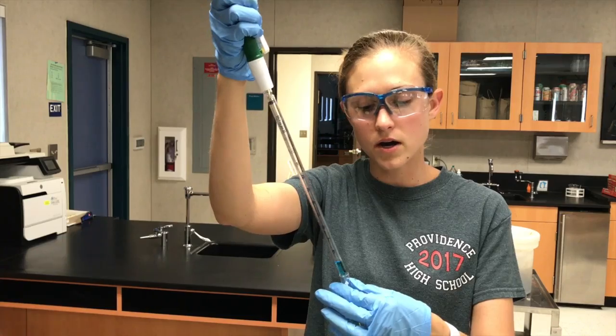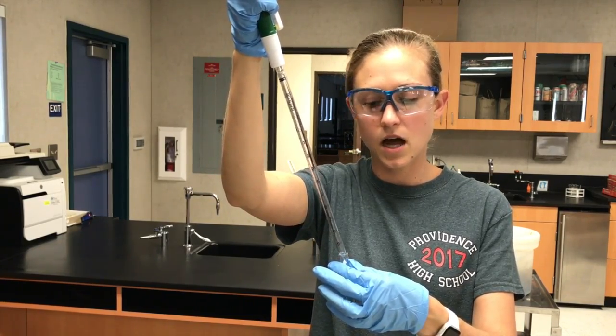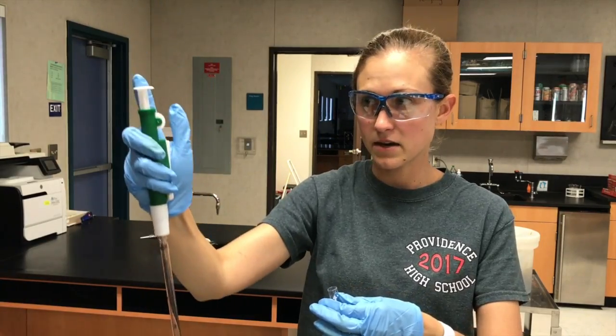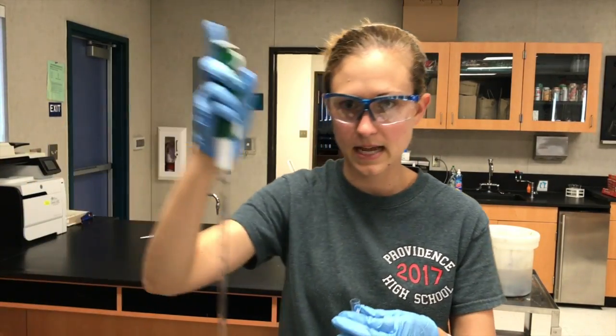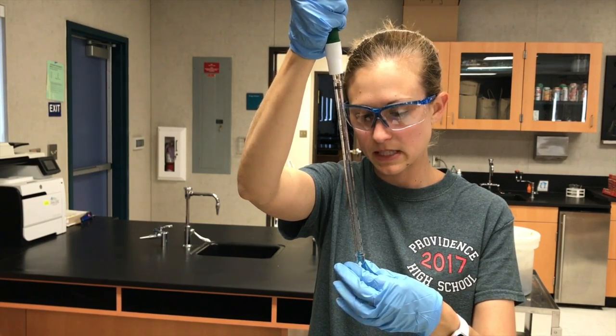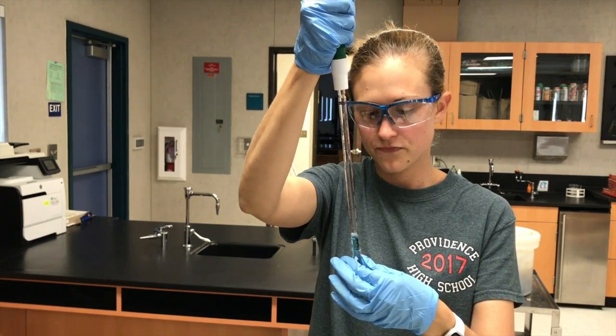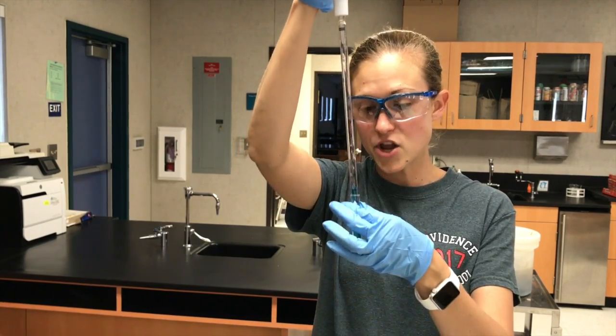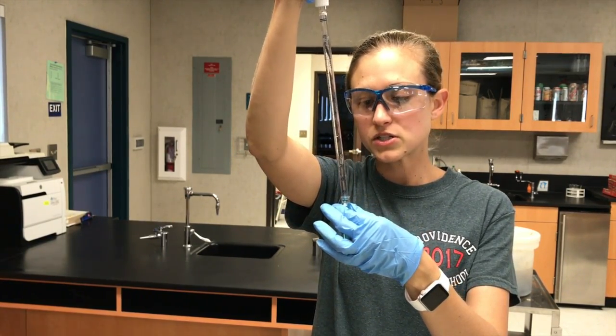Now, if you are completely sure that it mixed, awesome. But what I always do whenever I'm mixing in a cuvette, I'm going to, again, make sure that you push that down so it's all the way down. I'm going to scroll up. I'm going to suck up some of this liquid. And then I'm going to release it. And you can clearly see it mixing. Okay? So now my solution's mixed.